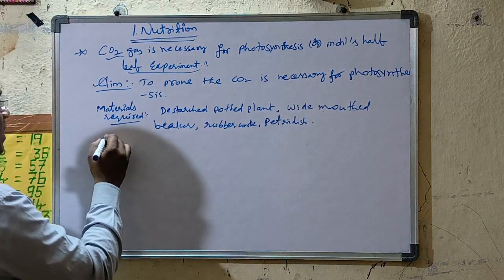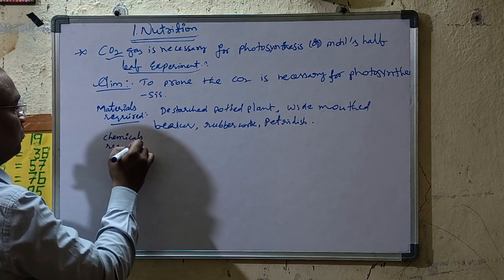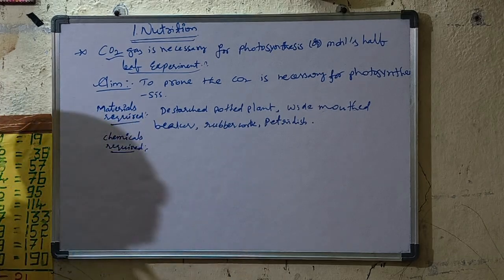Next, chemicals required. What chemicals do we need?